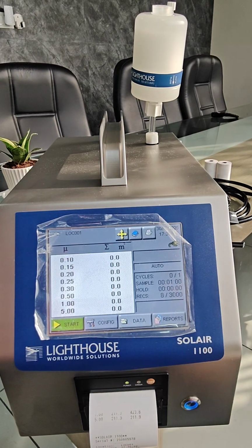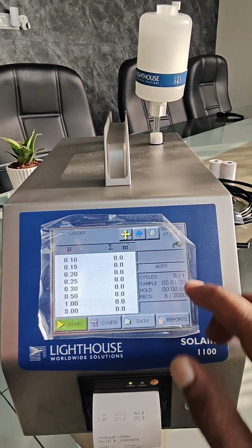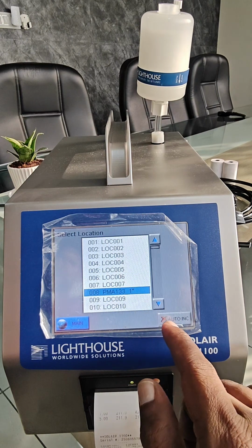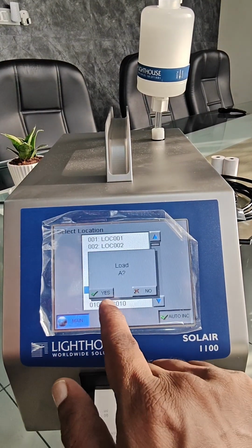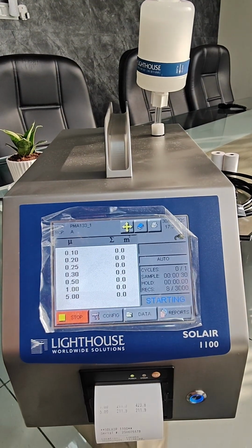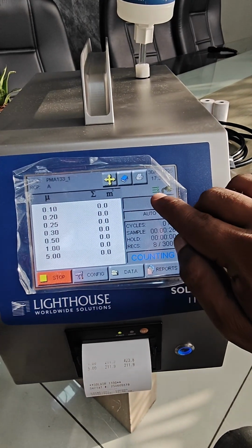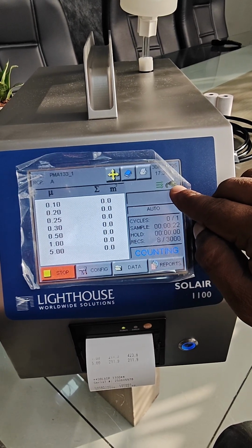So now a simple thing, what the end user has to do. You have to select that. Okay, whenever you want to reload, yes, start. This means there is no flow error, and this is on battery, on power supply.